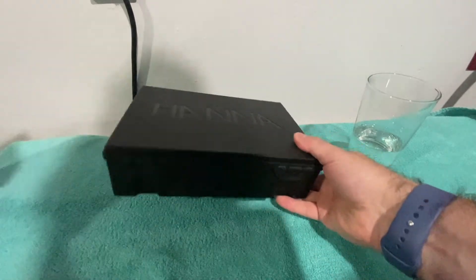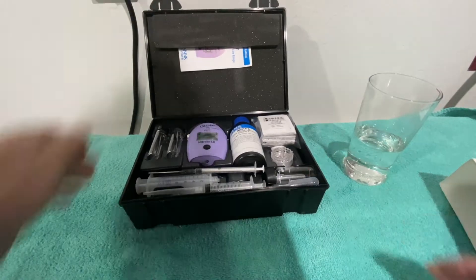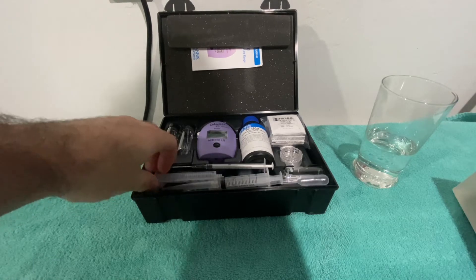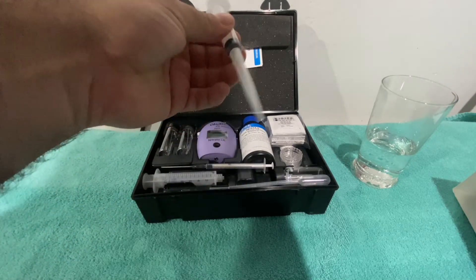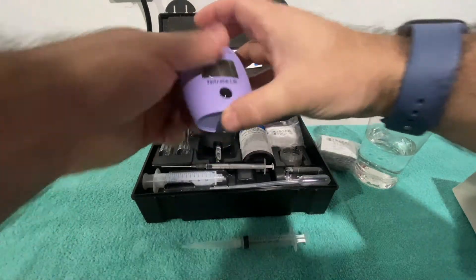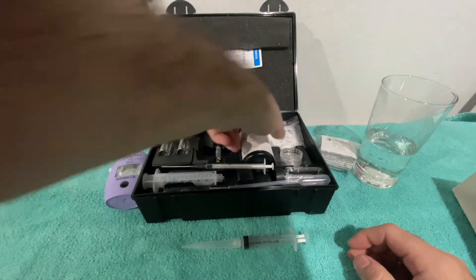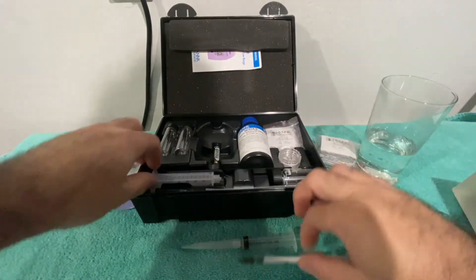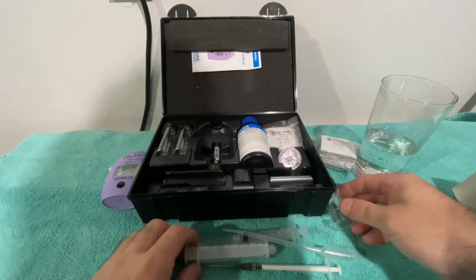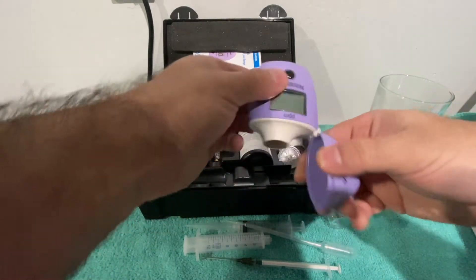When you first open it up there is quite a lot of stuff in here — a little bit more than any checker I've ever seen. We've got two vials like normal, and a number of different other things. There's a lot of stuff in here. I'll go ahead and put the battery in the unit.